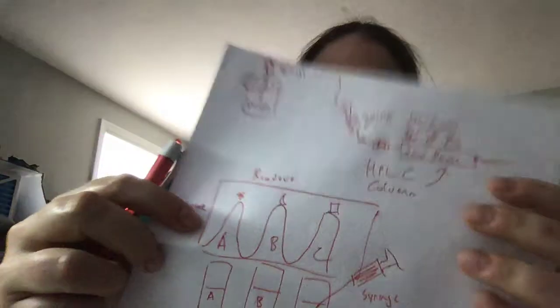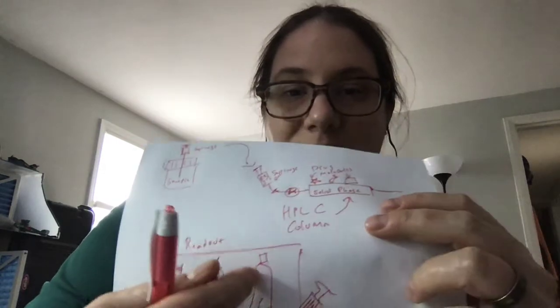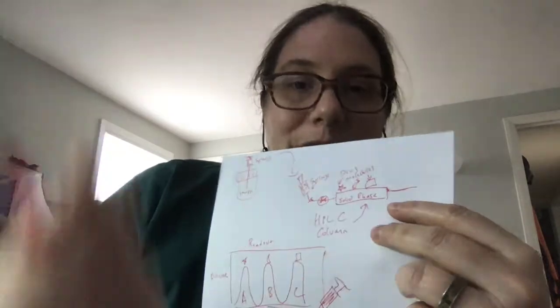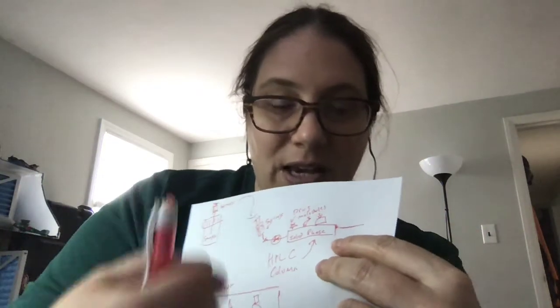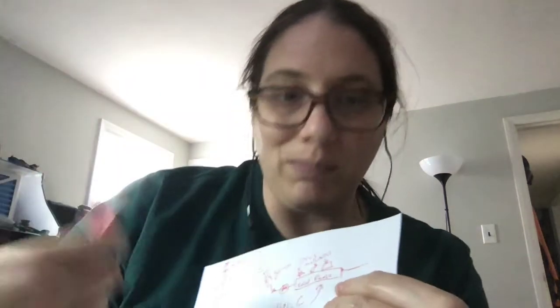And combining that with the data from the LC, the liquid chromatography that we did before, allows you to identify that, okay, yes, this single peak here, this sample C, is the molecule I'm calling square, because it has the molecular weight of square, and when I break it apart, its connectivity is the same as what I would expect for square. There are 3 methyl groups, there's an amide, and so on.